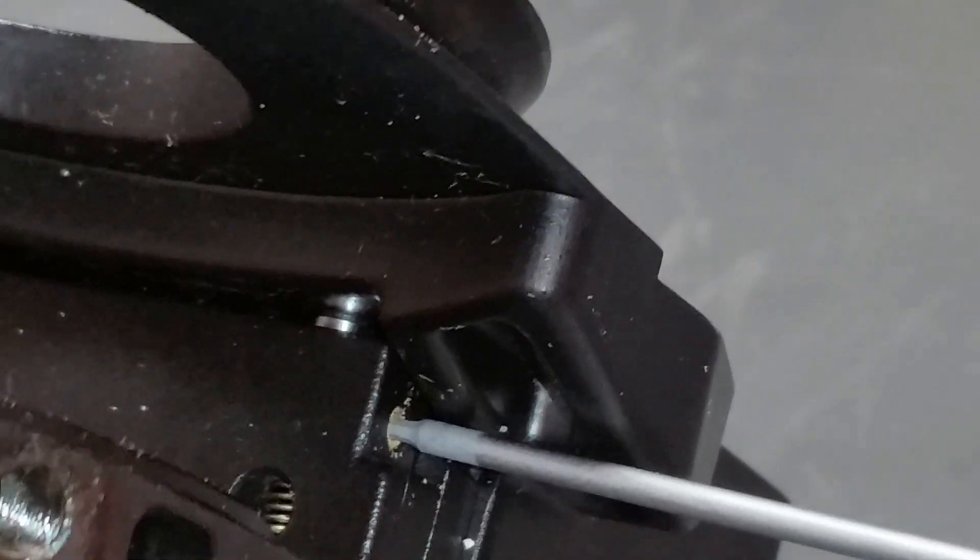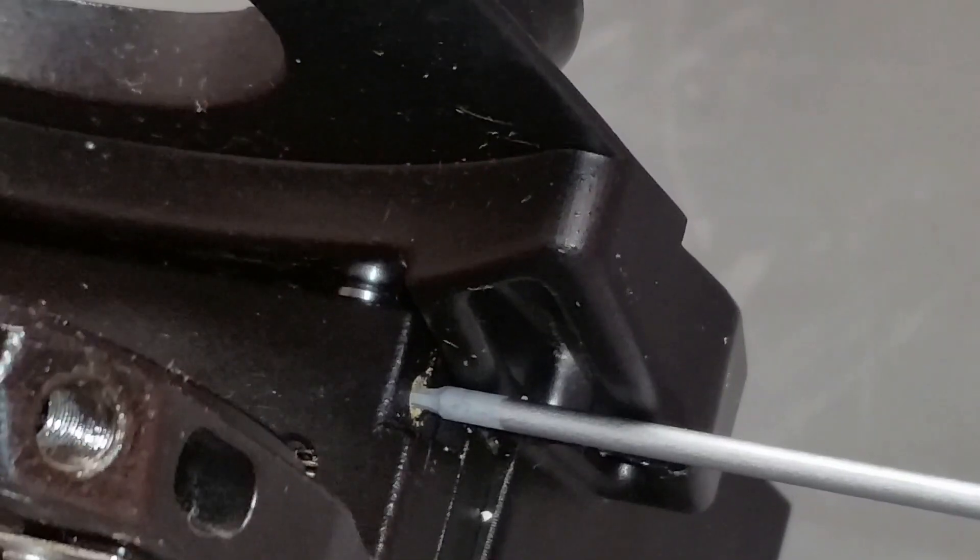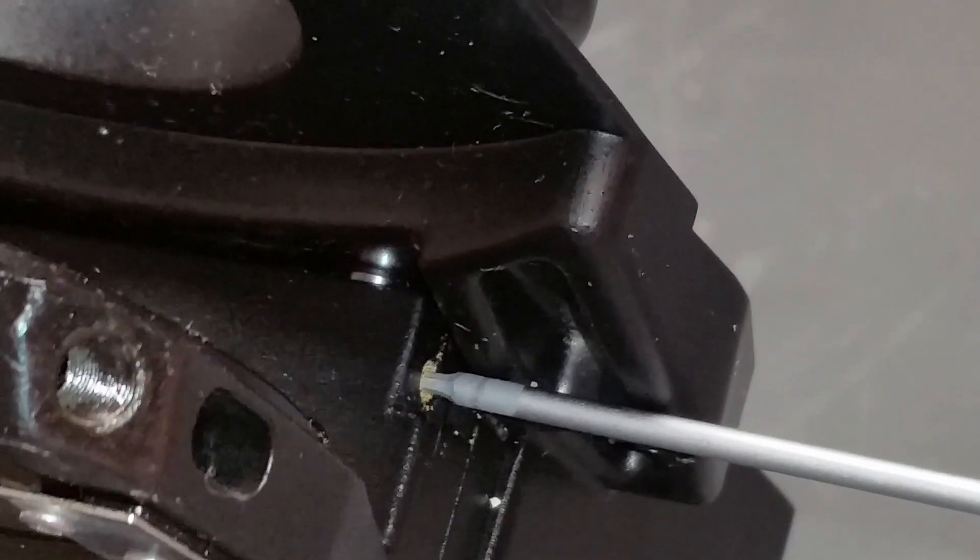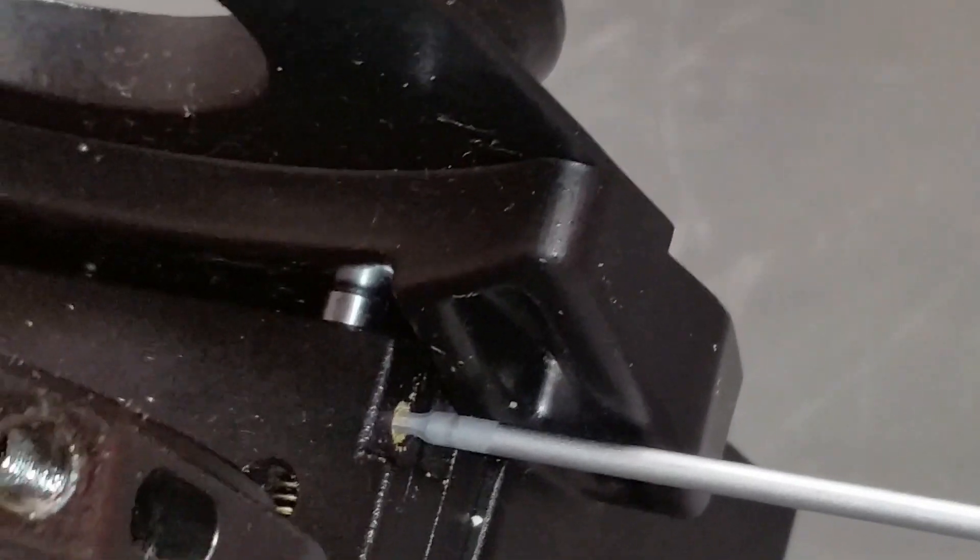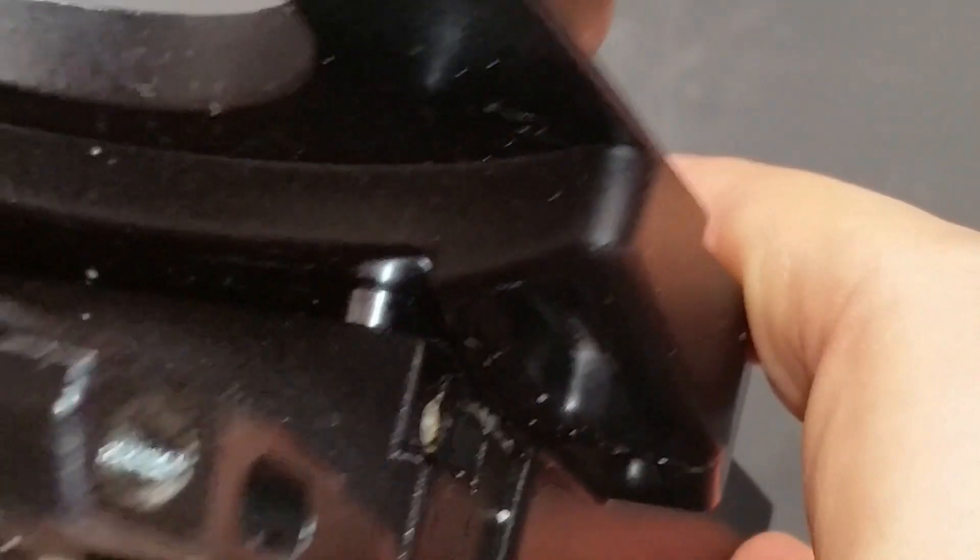Alternatively, if I decided it needed to be lower, I would take it to the top, loosen this up, lower it down to wherever it needs to be, tighten it back down. And that's a new position.